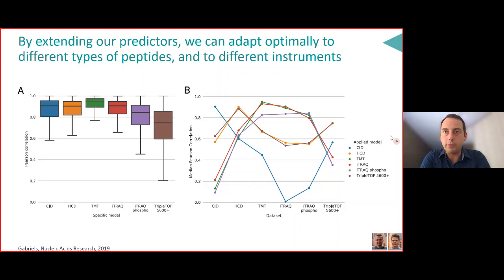So we did quite a bit of work on that in the past, and I know about these overlaps and the fact that you can get noise added to the real quantification, especially on the lower amounts. And so the MS3 really helps you distill the signal from the iTRAQ label.